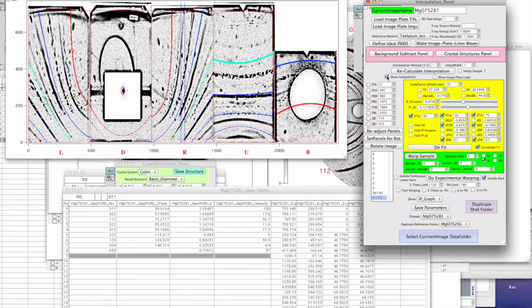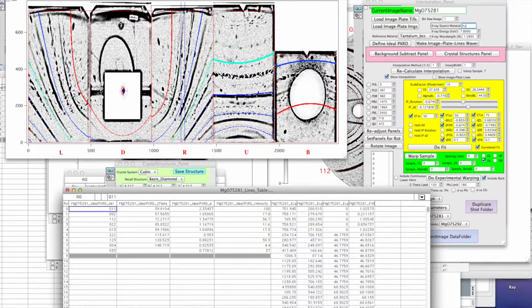So also the calibration is not great. Well, if I can do the fit again. No, not now. Why not? Well, because you are at the wrong wavelength. Oh yeah. Okay. So, that's a question I have actually. I can do the fit now, right? Yeah.